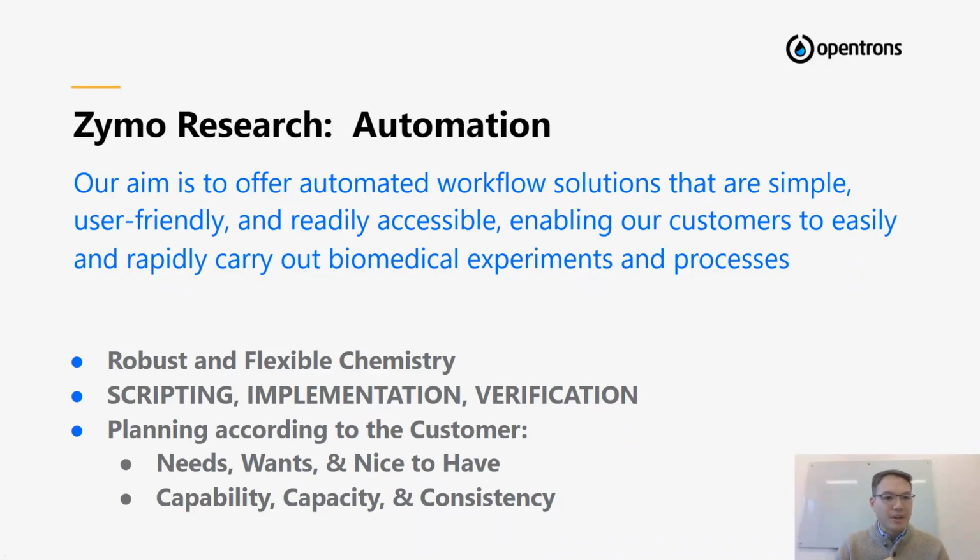We utilize the term verification because verification means that we have particular metrics that we want to hit from our kit on the OT2 system, but it doesn't necessarily validate for a particular experiment. So that's really the only difference between the two terminologies.